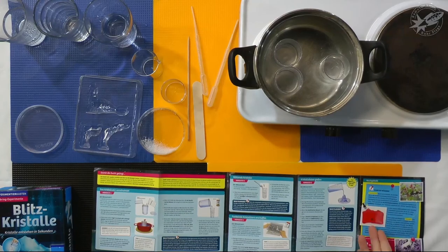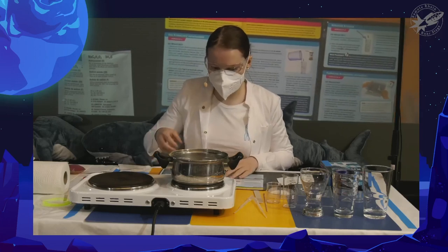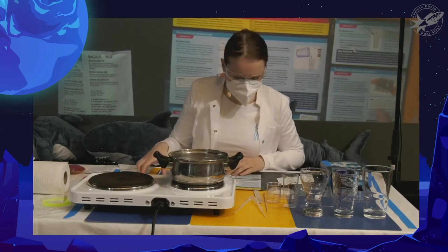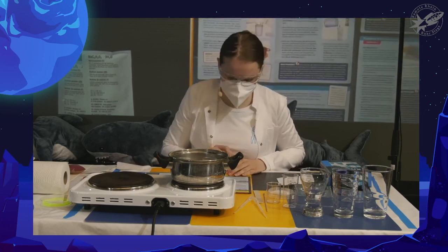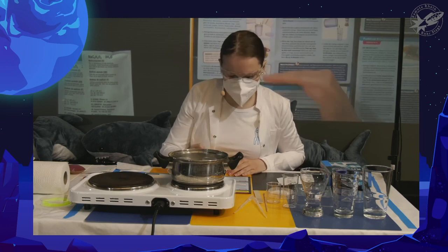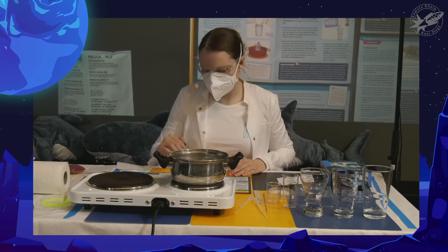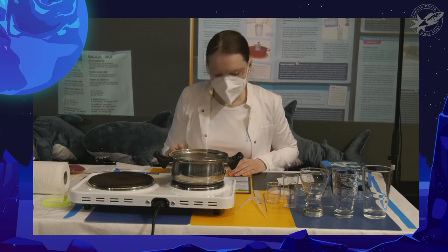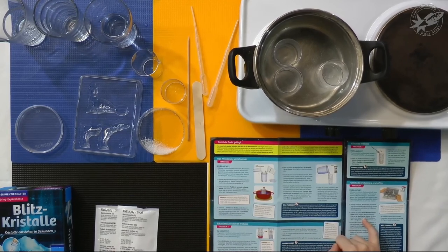It's also nicely depicted that this is used in a hand warmer. On the back, we have the experiments. The very nice depiction of the hand warmer I showed earlier. We're going to start from the beginning. I will do this experiment slightly differently, because these experiments are based upon one another, and I already did the first one slightly differently than explained here.